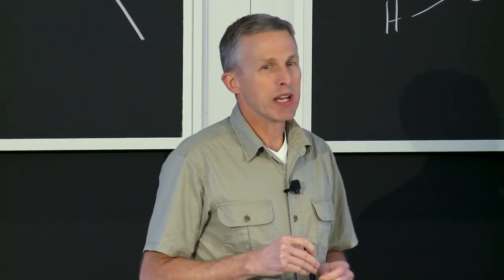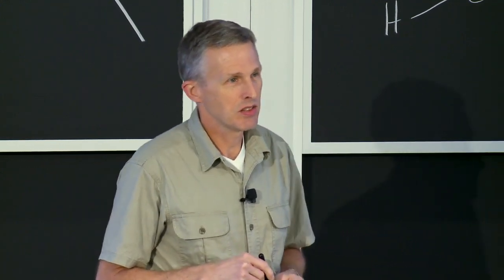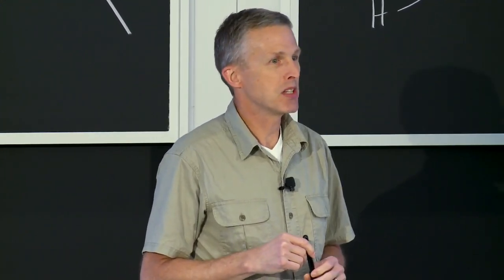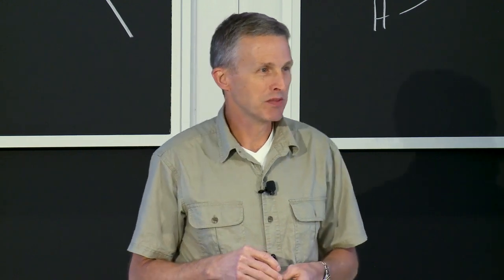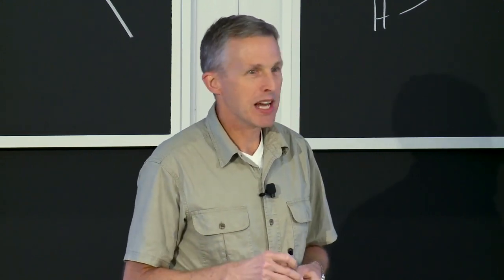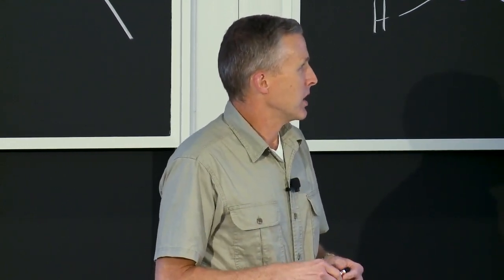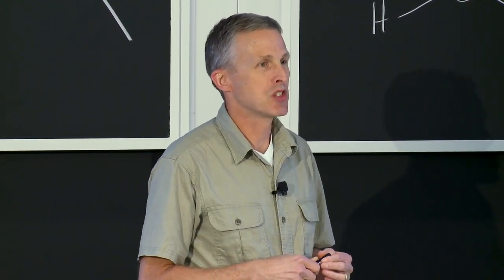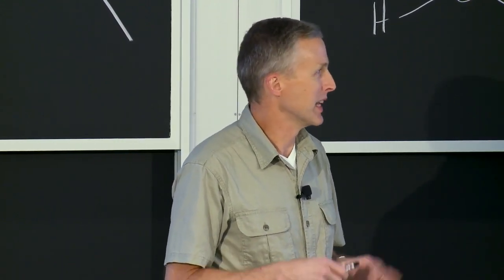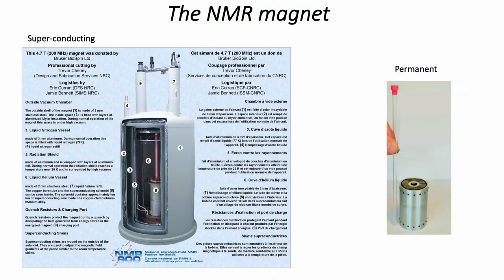There's been a great improvement in those in the past, I guess, 15 years or so. There used not to be any benchtop instruments. It was difficult to engineer and machine permanent magnets that would give a uniform magnetic field, but they've been able to do that, and so there are a lot of benchtop instruments out there now. The standard NMRs, which are termed high-resolution NMRs because they have stronger magnetic fields than can be generated from permanent magnets, use what are called superconducting magnets.